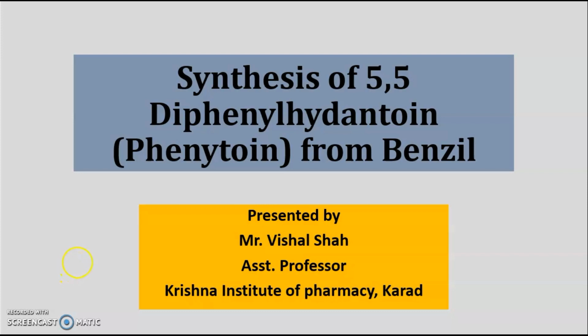Today I will be covering the practical part related to medicinal chemistry, where we will see how to carry out the synthesis of 5,5-diphenylhydantoin, which is also known as phenytoin. This is the common name for 5,5-diphenylhydantoin from benzil.